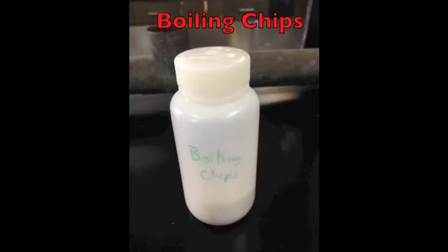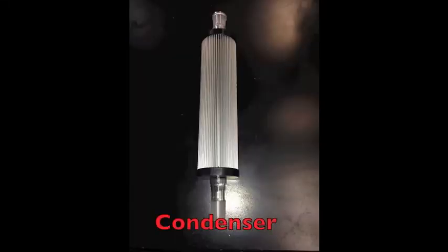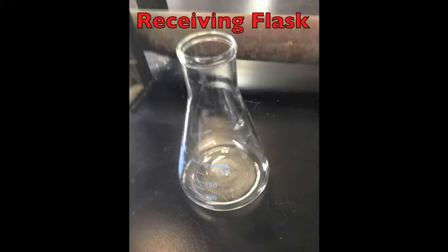These chips will promote boiling and must be added to the liquid before it is heated. Once the boiling chips have been added, safely attach the pot to the stand as shown here. To further reduce tipping, place a brick or two on the bottom of the stand. We will then be ready to attach the condenser to the stand. Underneath the condenser, place the receiving flask. The setup should look similar to this.